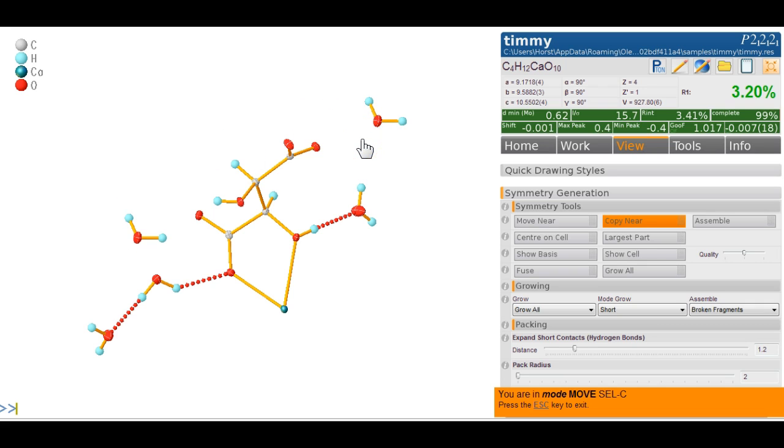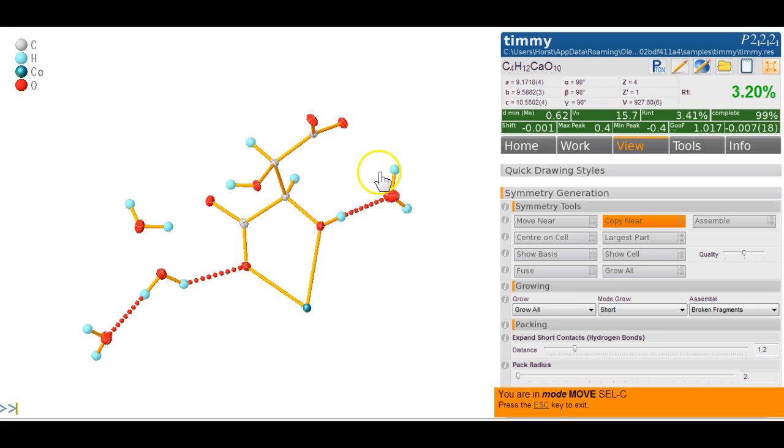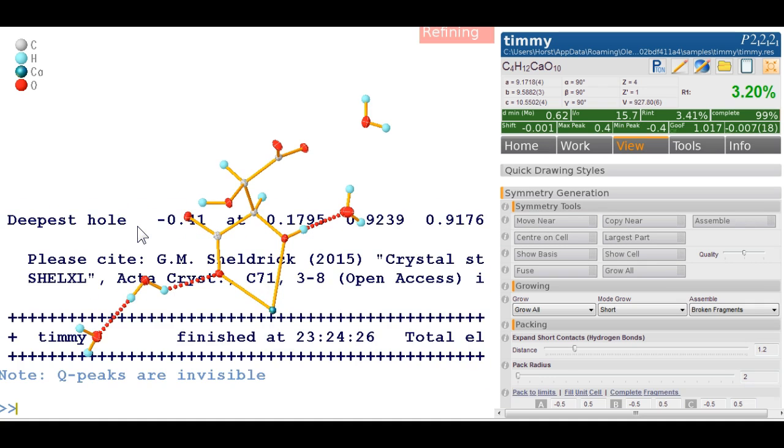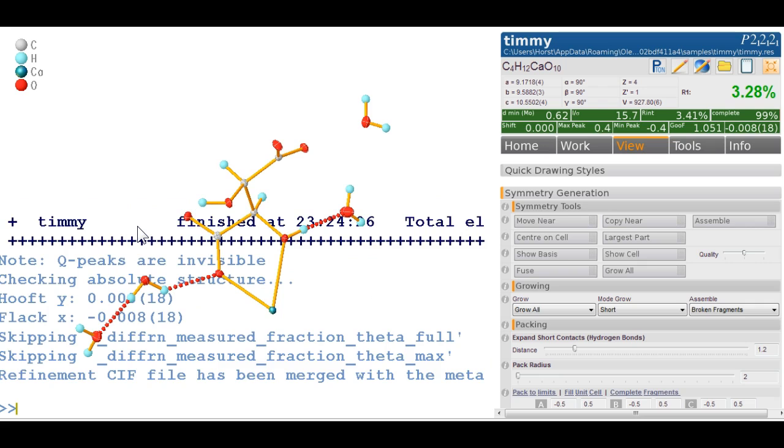If you then refine, this is where the molecule would stay. We go fuse because now we've got symmetry equivalents. I do this again with move near—escape first, click on this, move near, and we do this. We now have moved it over. If I click refine or type Control R, this is where it's now going to be.